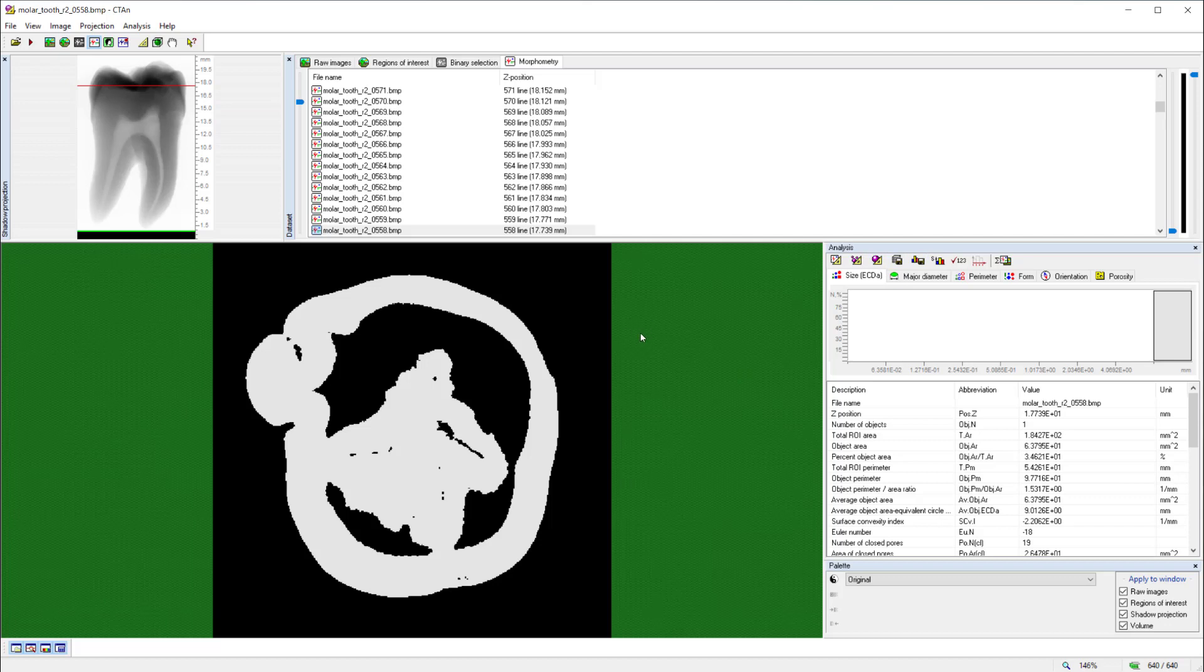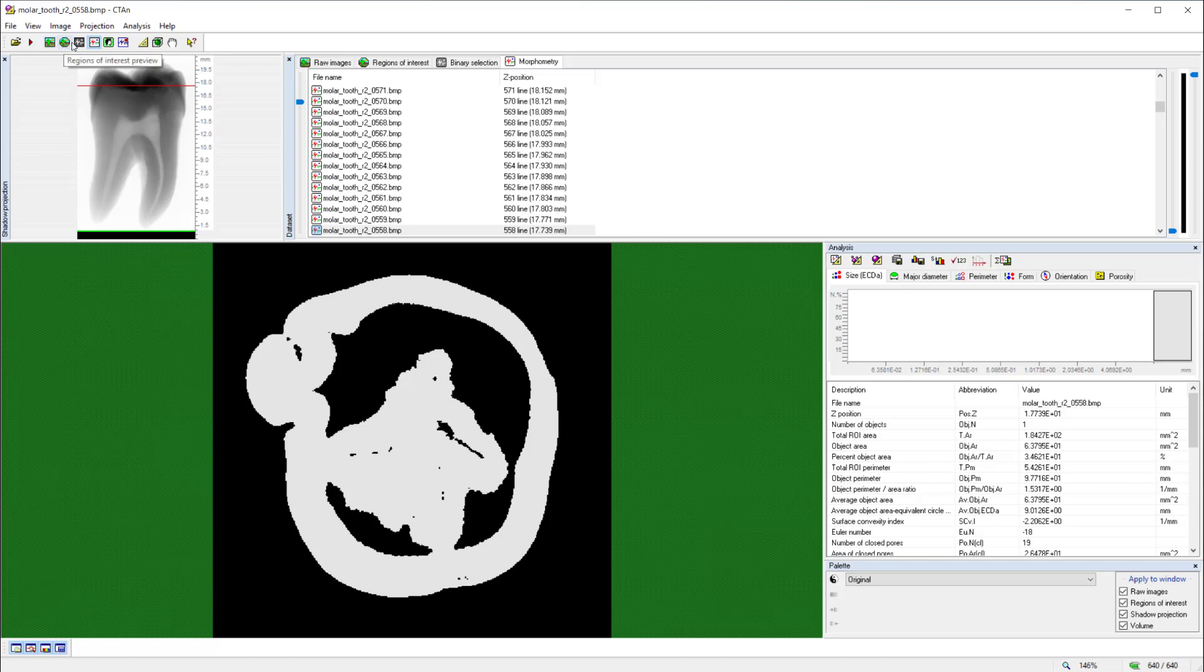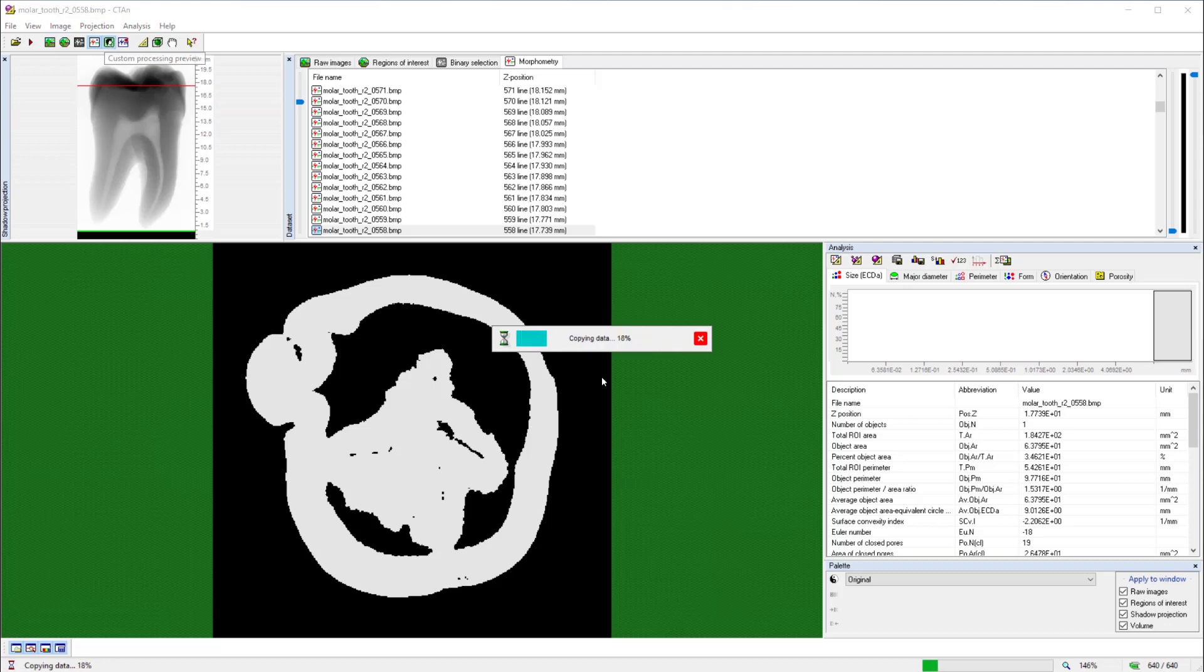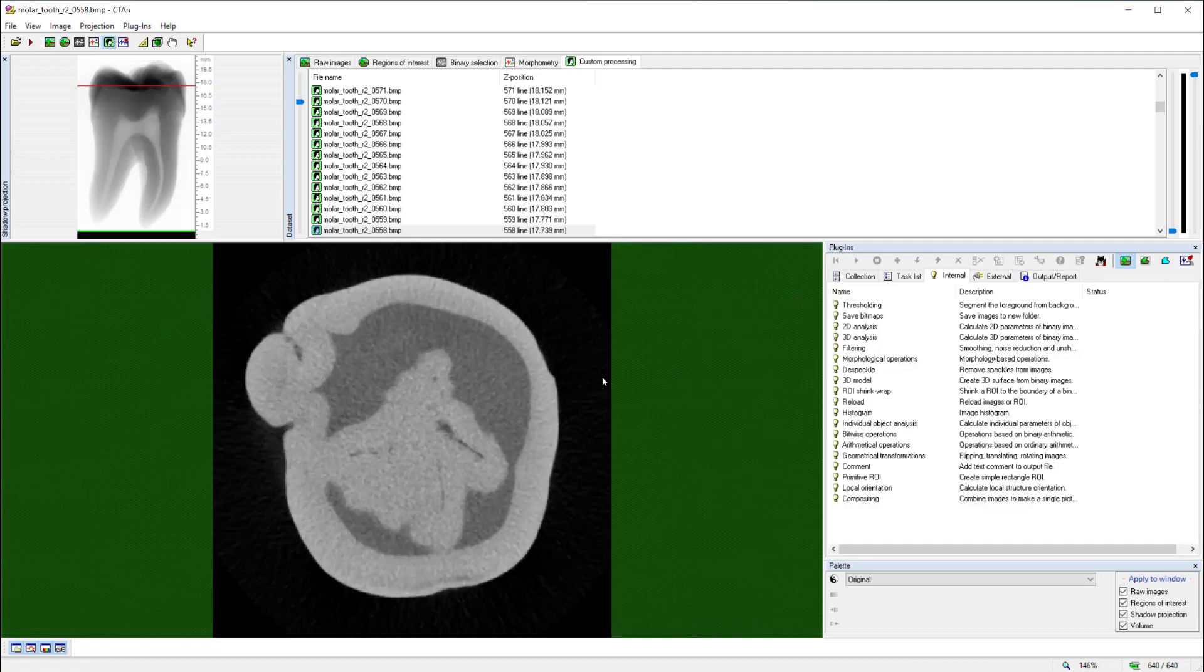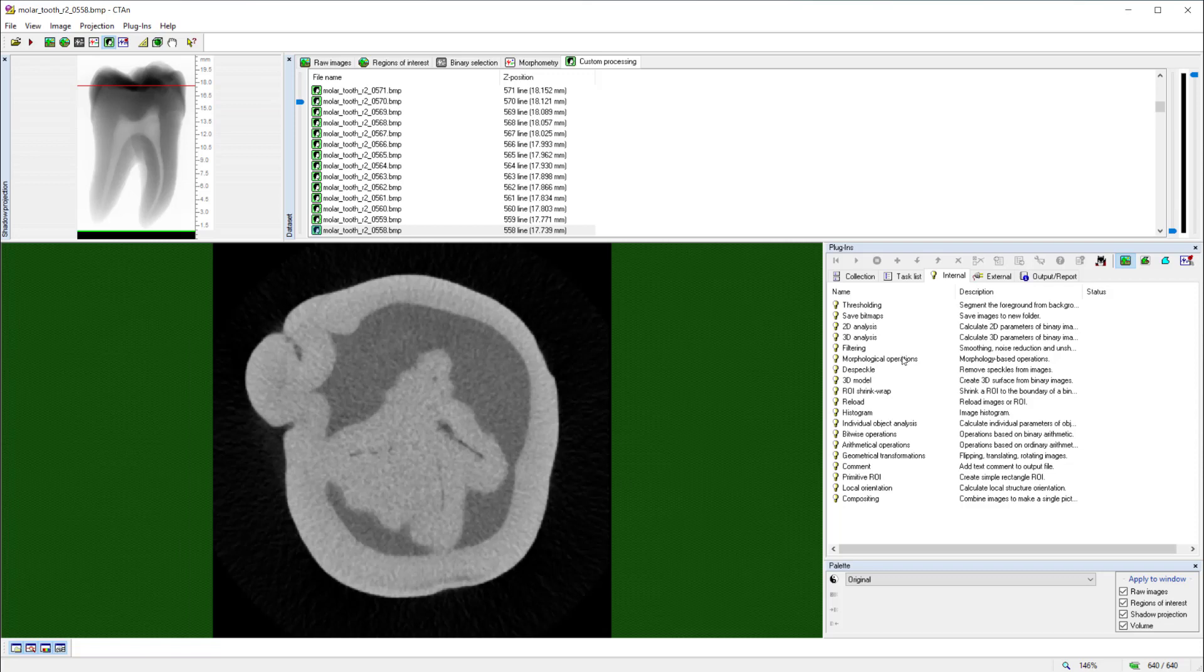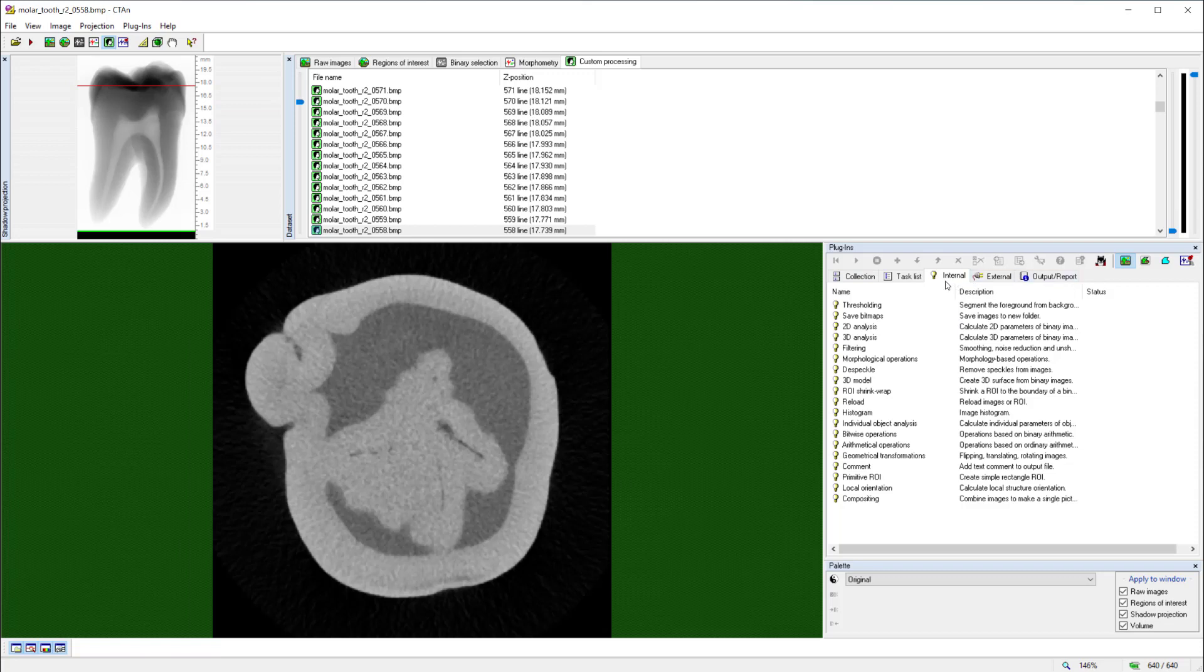There is, however, a fifth page, which allows us additional functionality and flexibility in our analysis. And that is the custom processing preview, or custom processing page, the fifth of the five buttons in this row at the top left. If I click on that button, a progress bar runs across, because the program is generating an additional copy of the dataset in its memory. With custom processing open, we see a different content in the pane to the bottom right of the program window. By default, the pane will open in the third out of five tabs, which is called internal. This means all the functions, they are sometimes called plugins, that are present within CT Analyzer itself.